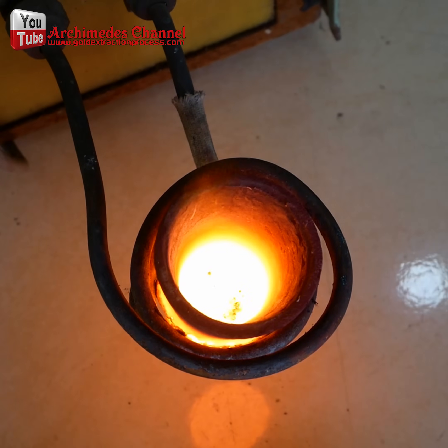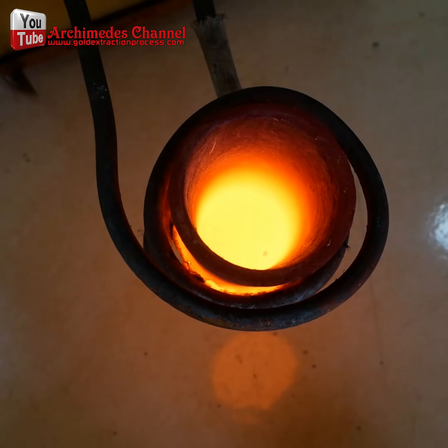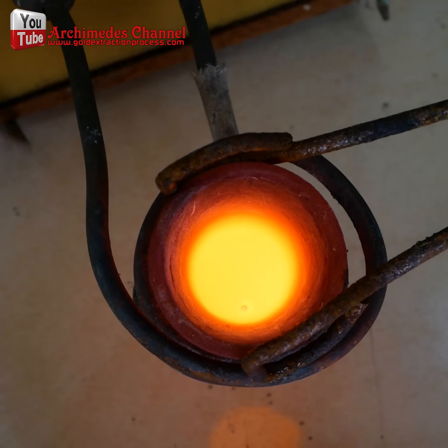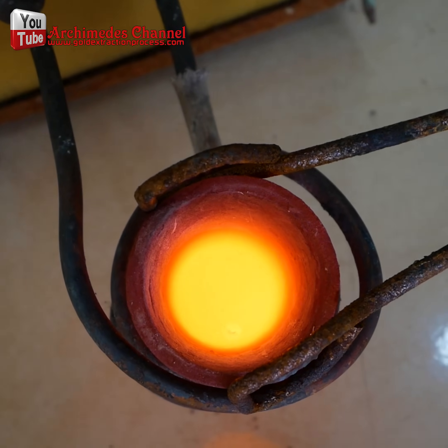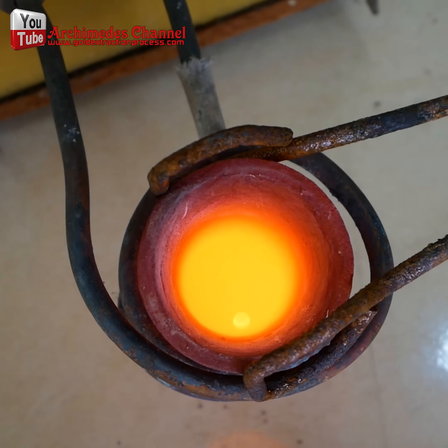After that, I added a little borax powder to further clean the gold particles. I placed the hard, but still hot, gold particles into a mixture of two parts nitric acid and one part water. This solution further cleans the gold particles.